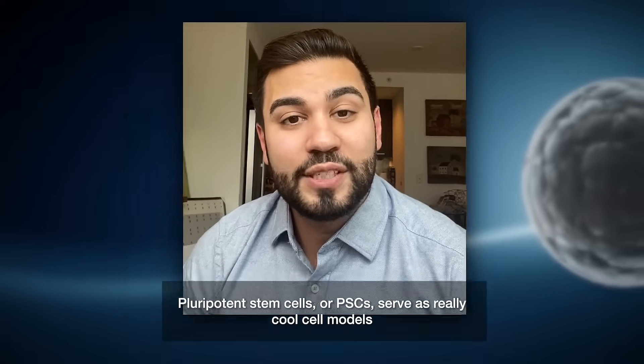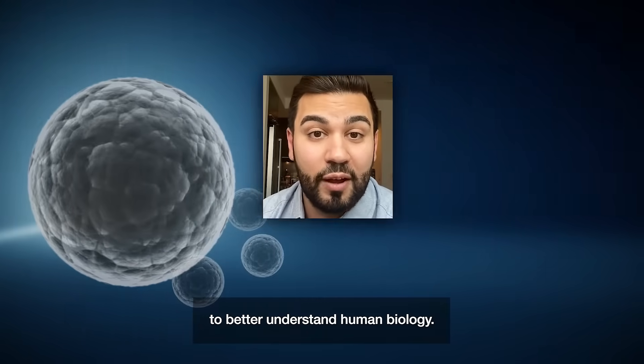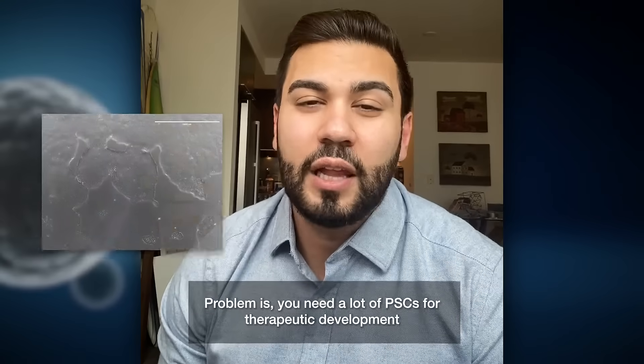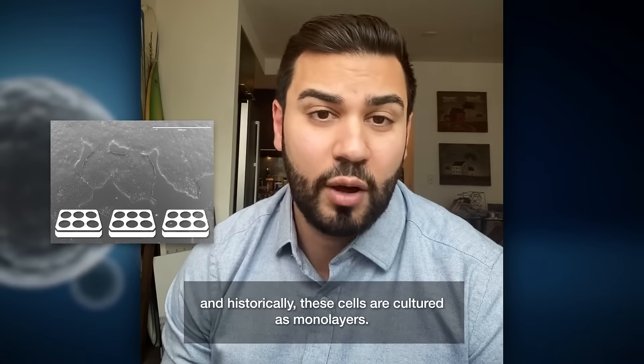Are you curious about stem cell suspension culture? Pluripotent stem cells, or PSCs, serve as really cool models to better understand human biology. The problem is you need a lot of PSCs for therapeutic developments, and historically these cells are cultured as monolayers.